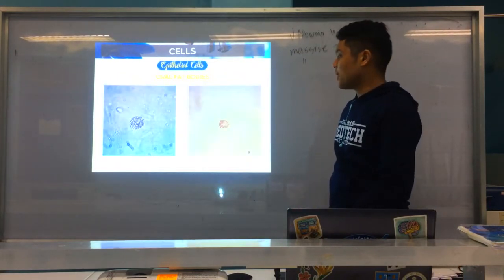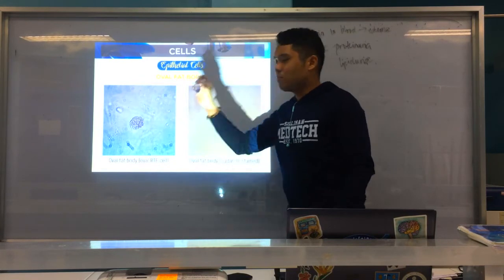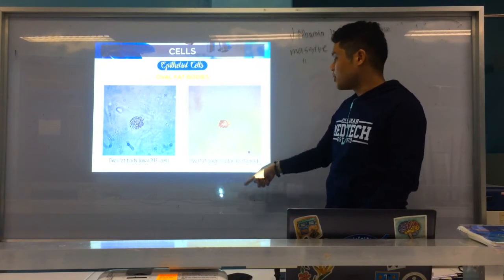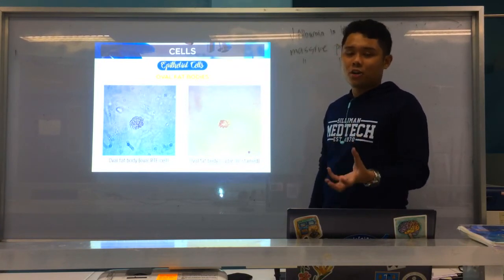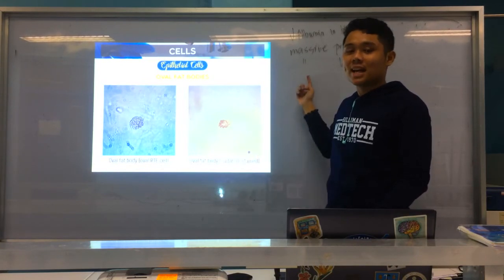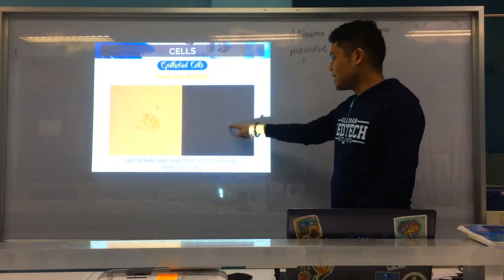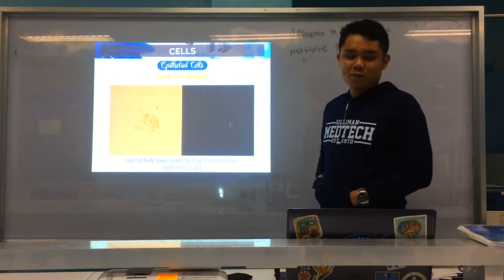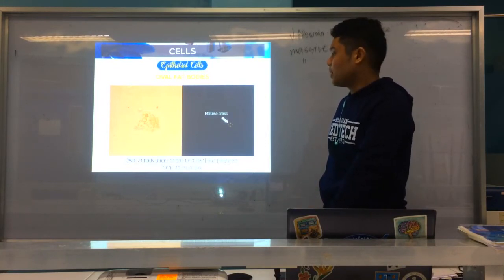Here is an example of oval fat bodies. It looks like many circular fat globules attached to the cell. It is stained by Sudan III, showing orange-red droplets. Since it stained, what possible lipid is in the oval fat body? It could be triglycerides or neutral fats. And here we have an oval fat body under bright field, and under polarized light it shows a Maltese cross. Which lipid shows a Maltese cross formation in the oval fat body? Cholesterol. Okay.